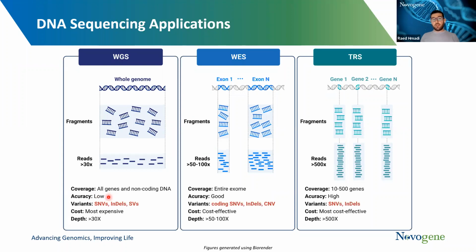Yeah, so at the end of the day, you have to imagine it like this. I can explain it in an example. If you have 1 million sequencing reads, if you decide to distribute them over the whole genome, then every part of the genome is covered only by a very small amount of reads.